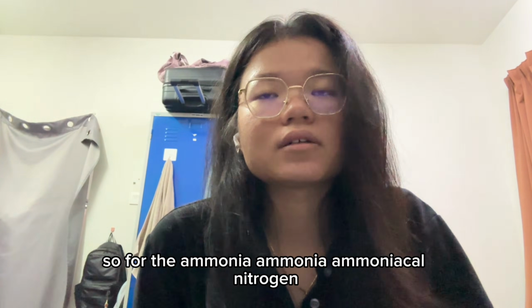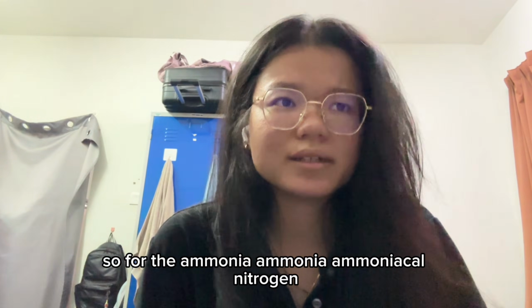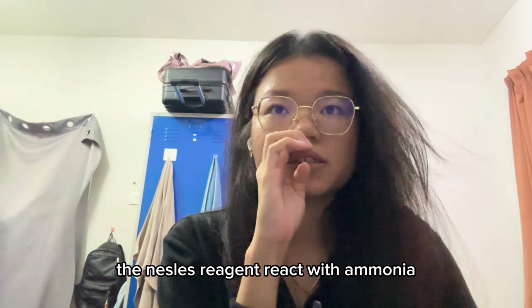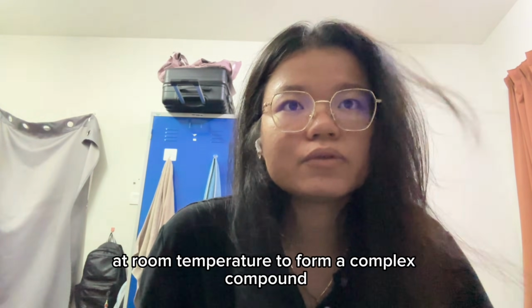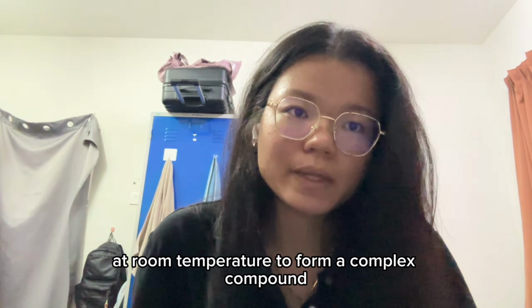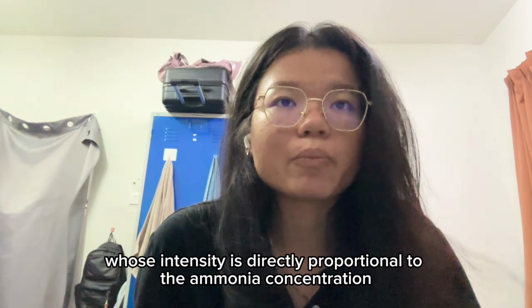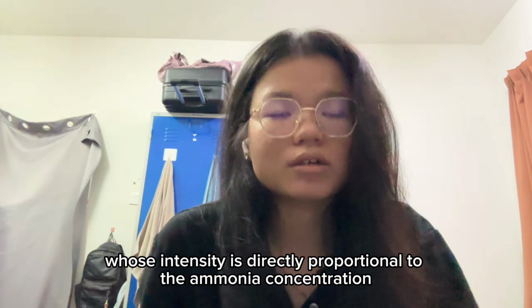So for the ammoniacal nitrogen, the Nessler's reagent reacts with ammonia at room temperature to form a complex compound. So this produces a yellow or brown color whose intensity is directly proportional to the ammonia concentration.